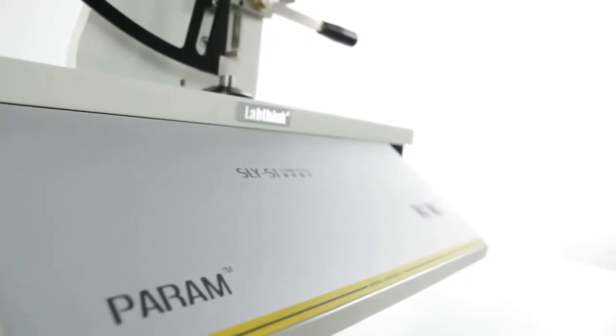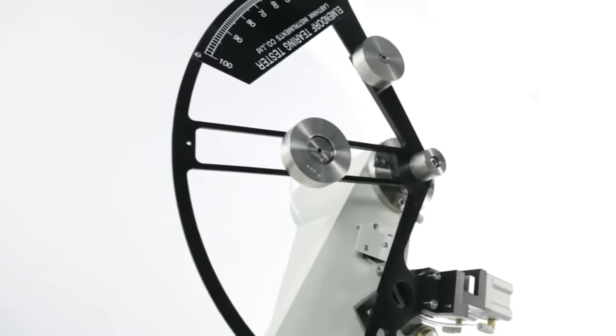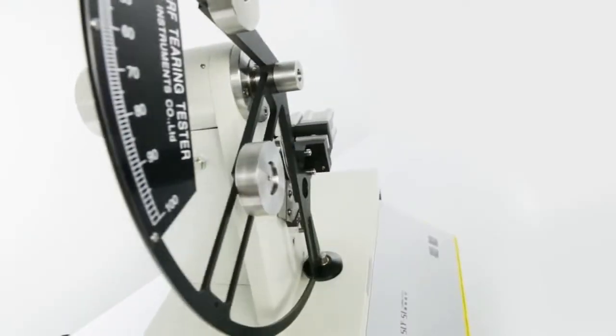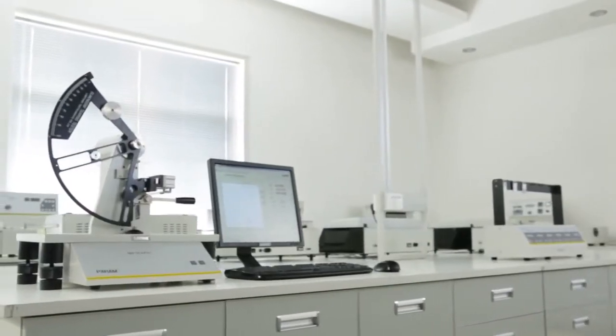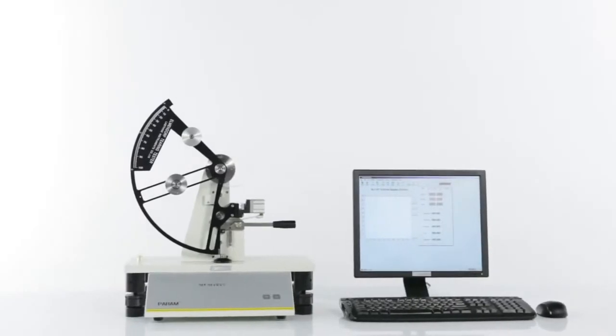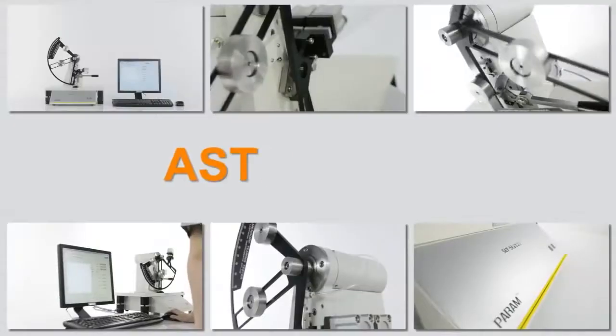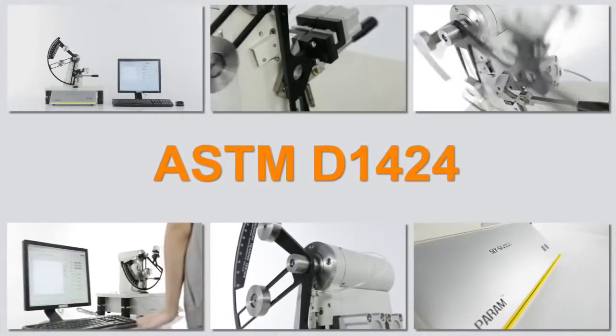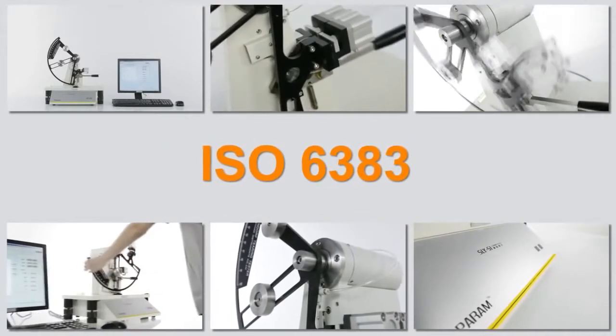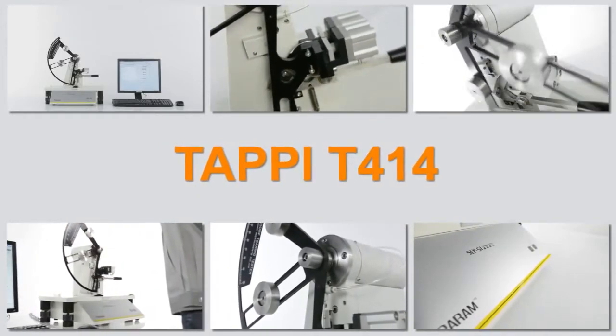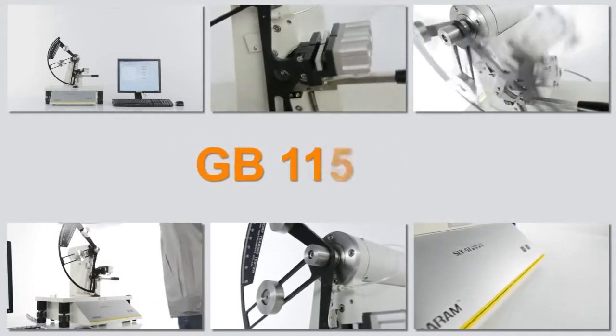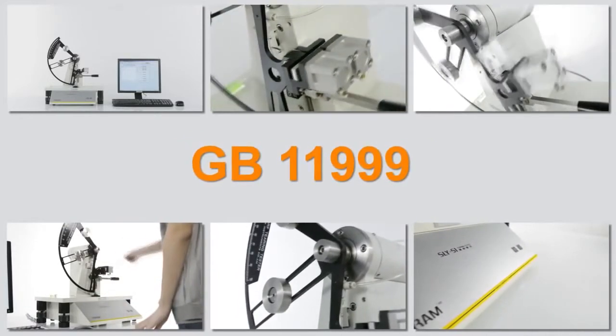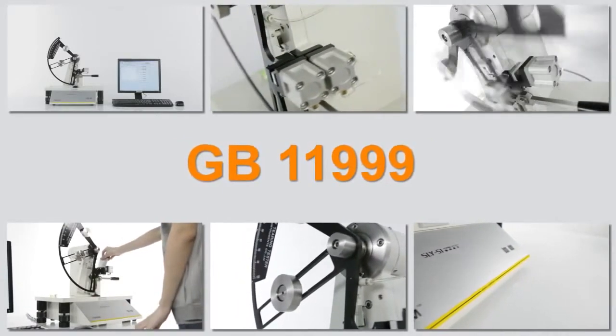SLY-S1 is LabThink's latest generation of electronic tearing tester, designed according to the Elmendorf Tearing Test Method. The testing principle complies with ASTM D1424, ISO 6383, TAPPI T414, GB 11999, and other standards.